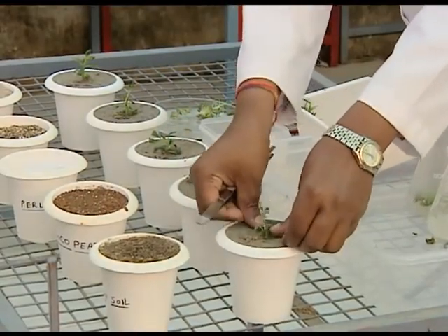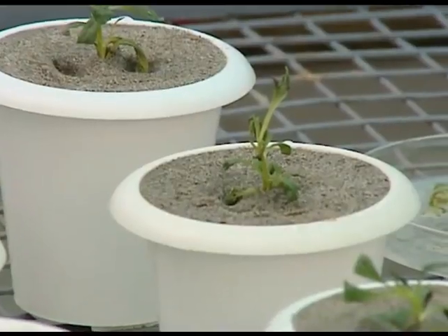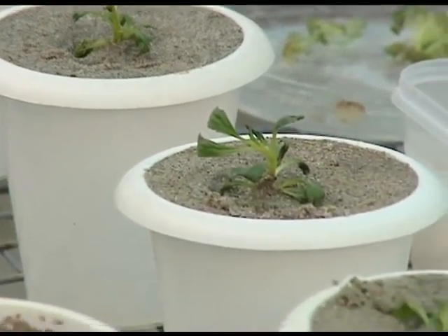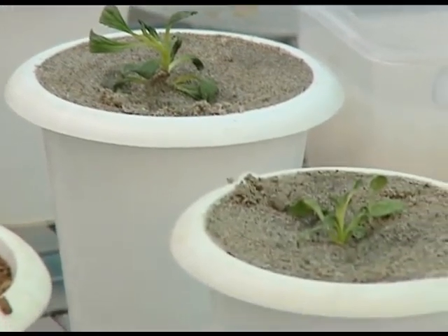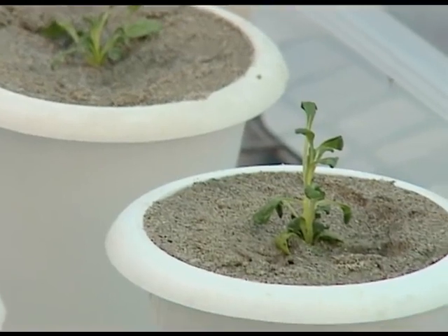After rooting and growth of plantlets up to 3 to 4 inches, shift these to a potting mixture containing garden soil, sand, and well decomposed farmyard manure in a ratio of 1:1:1.